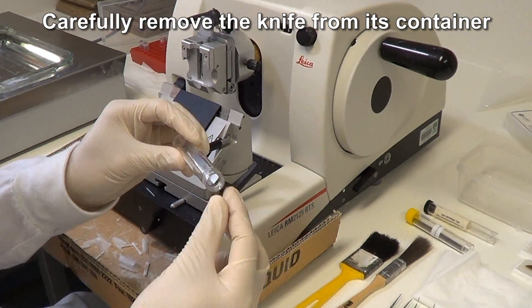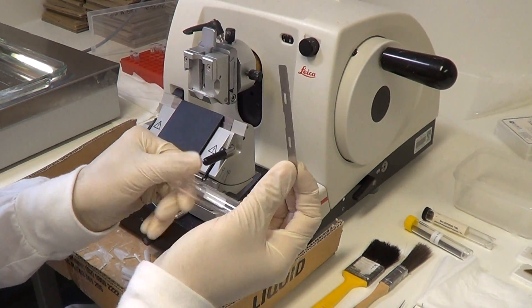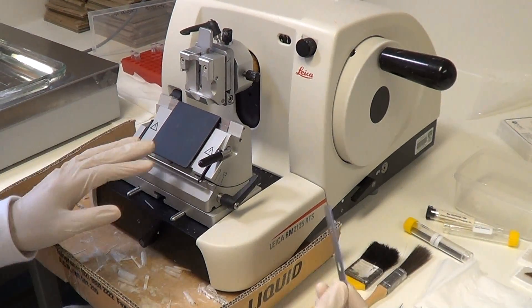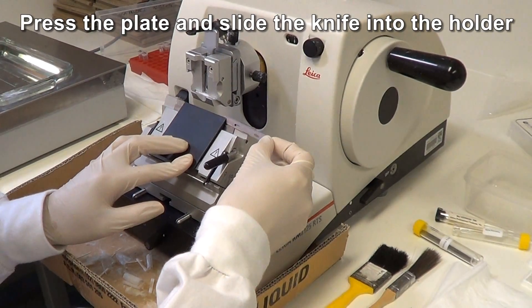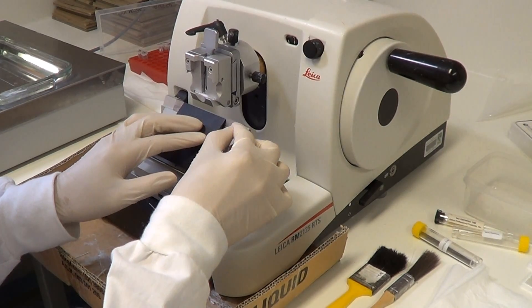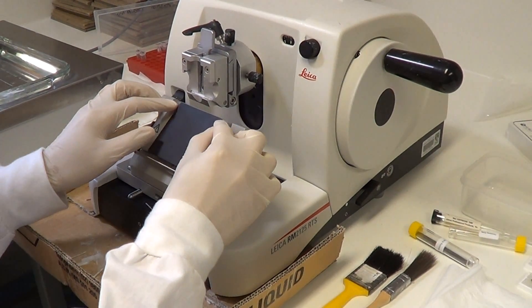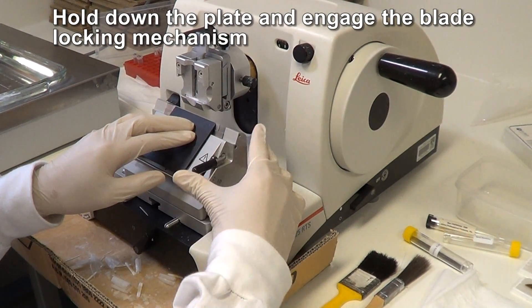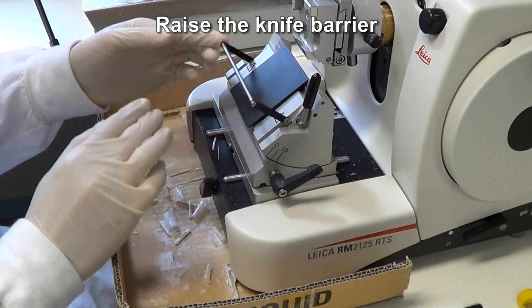Carefully remove the knife from its container and insert the knife into the holder straight away. To insert, press the plate, then slide the knife into the holder. Hold the plate down and engage the locking mechanism by lifting the lever. Then raise the knife barrier.